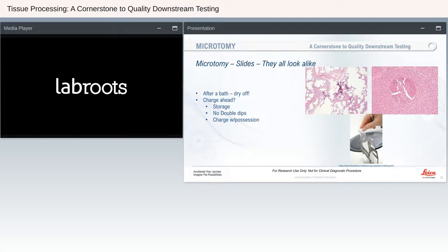So I've been told that recommendations are usually a low temp oven around 60 degrees Celsius for about anywhere from 40 to 60 minutes. You can see here's a couple of examples of things you'll see if water is trapped. The upper right-hand side, there's a water droplet that got trapped, and you can see it's quite evident once you stain it with H&E. On the left, the same issue happened with residual water. The morphology in this area, too, will be hazy and poorly defined sometimes, especially if they put the slides in a high heat oven.